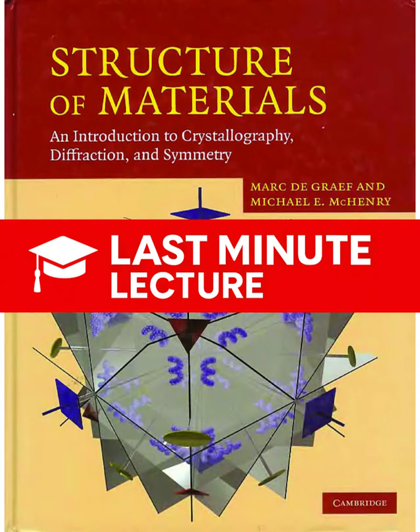This is where we really fully enter the realm of reciprocal space, right? Yes, this is the first big step. The wave vector k is the critical link between the incident X-ray beam and the crystal structure. It's a vector that, as you say, resides in reciprocal space. And it tells us two very important things. First, its direction tells you the precise path the X-ray is traveling.